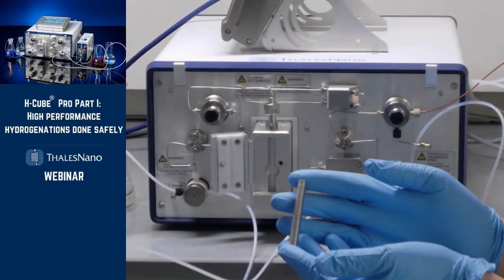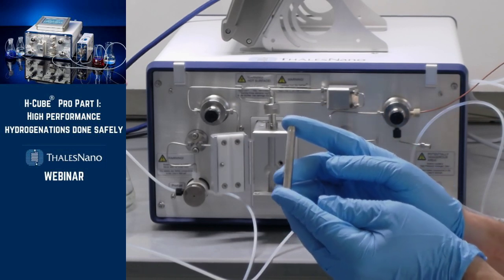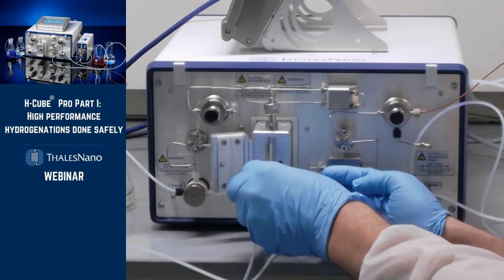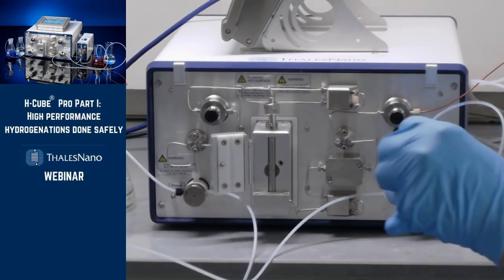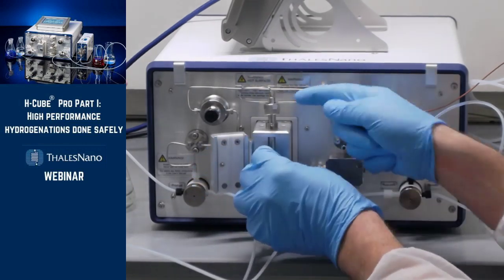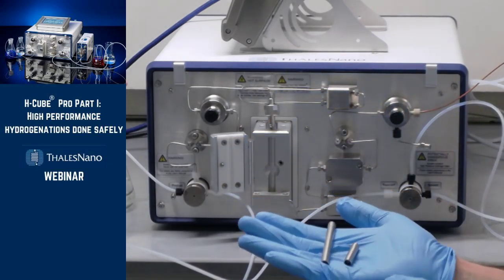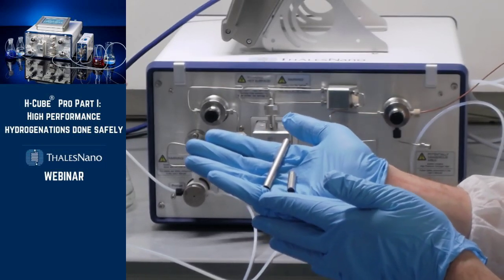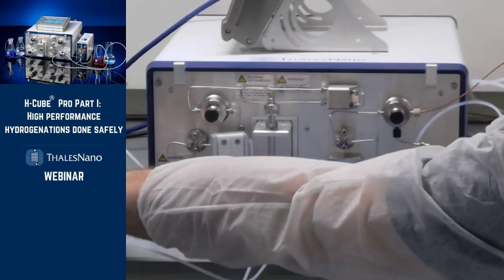So this is a 70 millimeter long cartridge. It contains approximately, let's say, 350 milligrams of palladium on charcoal. I will get a smaller cartridge as well, just give me a second. So this one here is just a 30 millimeter long version. I need both of them. So now you can compare their relative sizes. Obviously the small ones will fit a much smaller amount of catalyst.